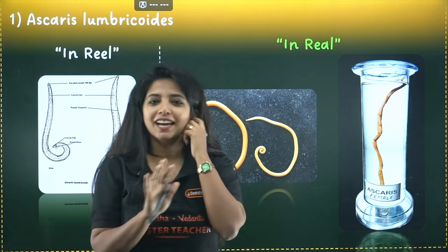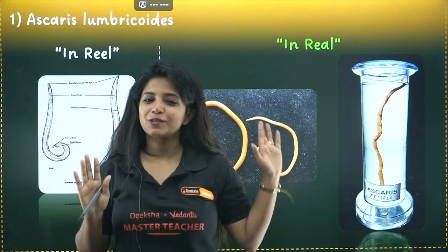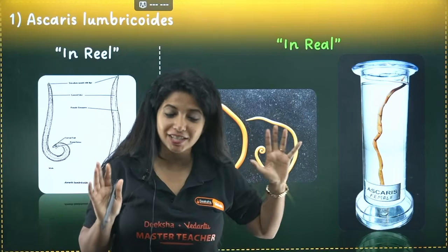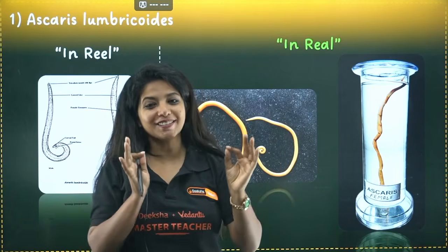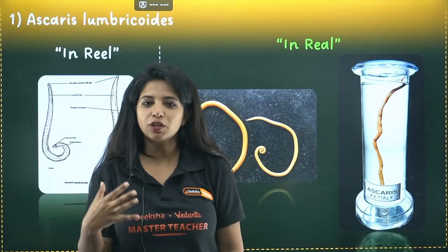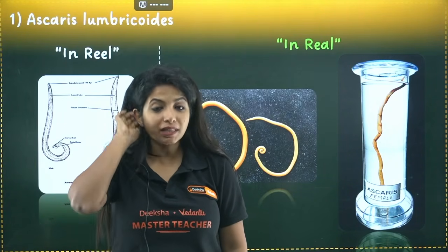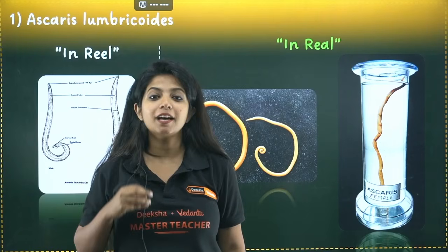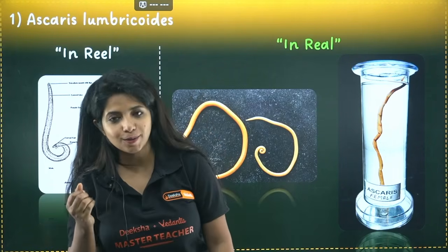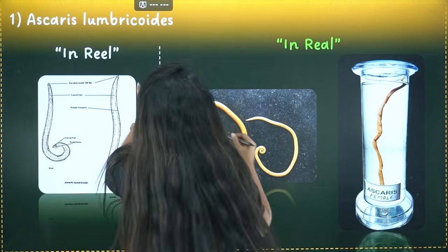Please understand, out of the 4 spots that you have, in our option for this identification of E, nothing looks like a worm. So if at all you see a worm, just understand it is going to be what? Ascaris lumbricoides. It is not annelids. Annelids are usually worms which we call earthworm. Earthworm and everything comes under annelids, but they are not coming under annelida. They are coming under Aschelminthes, and we also call them nematodes.